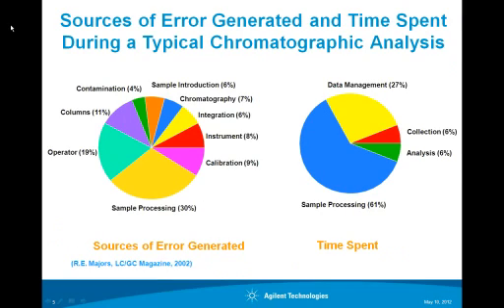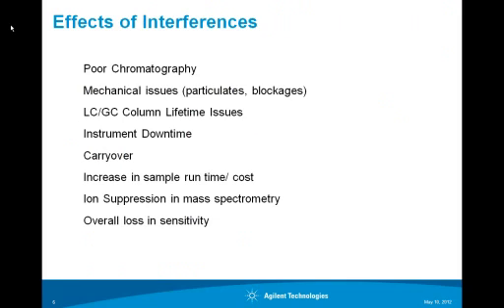For those of you who are familiar with sample preparation, you know, and this is not unusual information, that the sample preparation process is very error-prone. It's one of the largest percentage of issues where you will have errors. And it's also the largest percentage that you will spend your time on. That's why a lot of people would rather not do sample prep.